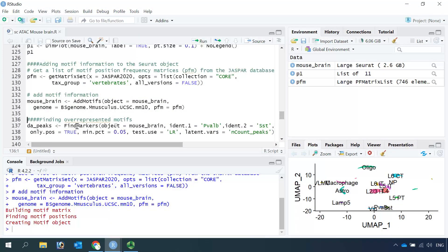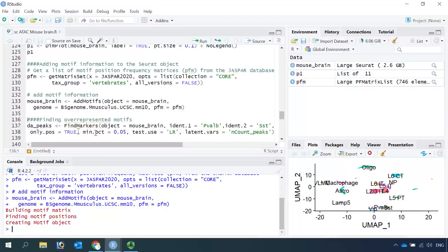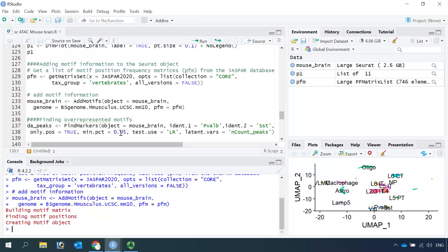We are going to use the FindMarkers function to identify differentially accessible peaks between the parvalbumin-positive neurons and somatostatin-positive neurons. We only identify the positive peaks. For the parameter of minimum percentage, the default setting for single-cell RNA sequencing data analysis is 0.1. Because single-cell ATAC-seq data are sparse data, here we use 0.05. So let's run the FindMarkers function.